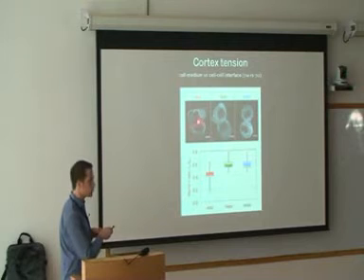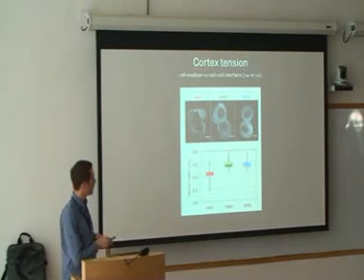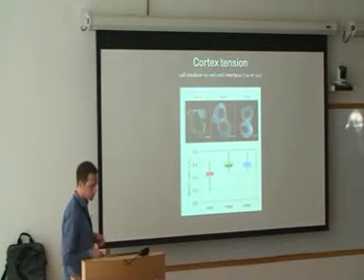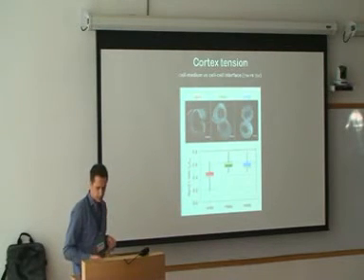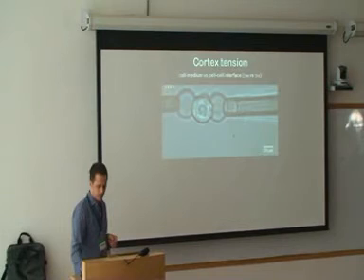And what we did, these measurements, just looking at the intensity of myosin, and what we find is that ectoderm most efficiently gets rid of myosin and actin at the cell-cell interface compared to the cell-medium interface. Mesoderm is less well able to do so, and endoderm not as well. It's similar to mesoderm. So that gives us some idea about the ratio of gamma CM to gamma CC.